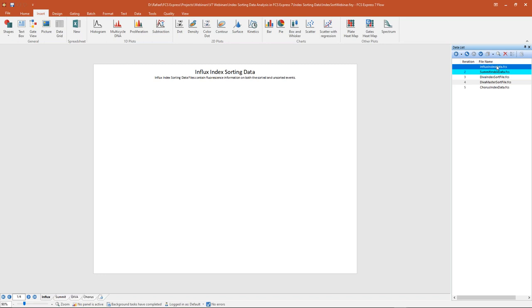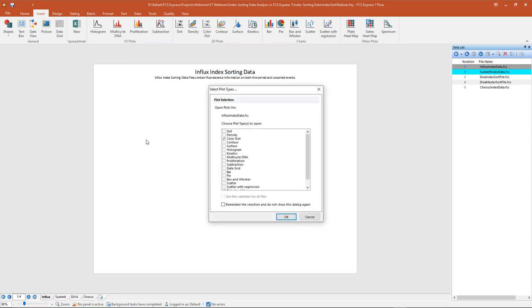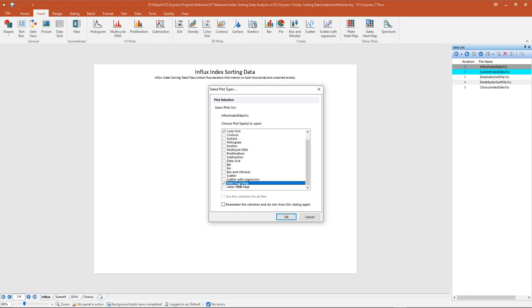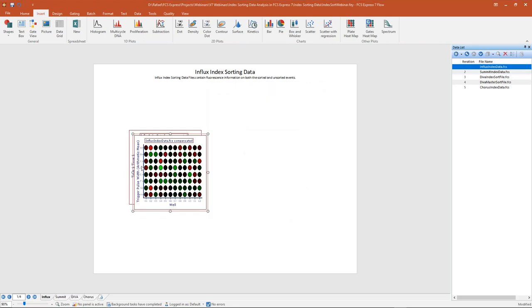I'm going to drag and drop that file right onto an empty space on my layout. We're going to be working with two different plot types: the color dot plot, to allow us to see color backgating from our heat maps, and the plate heat map, which will allow us to view our index sorted data. I'll click OK, and you'll see both of those plot types have been loaded onto my layout.